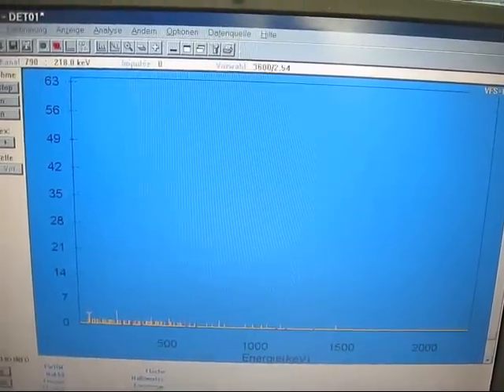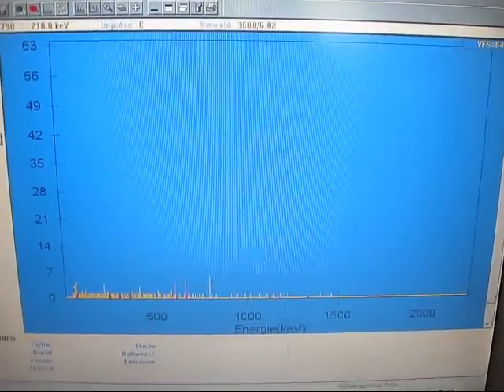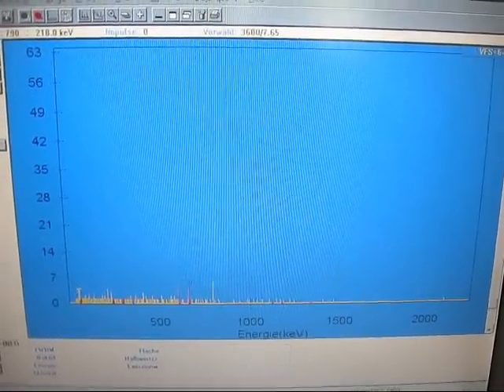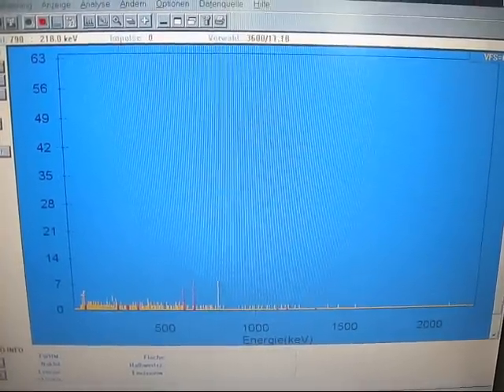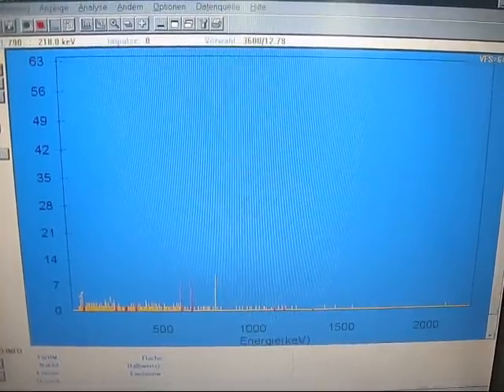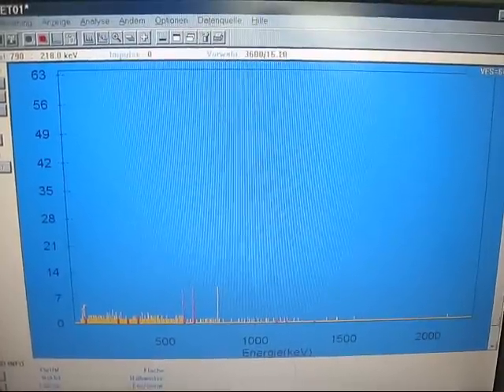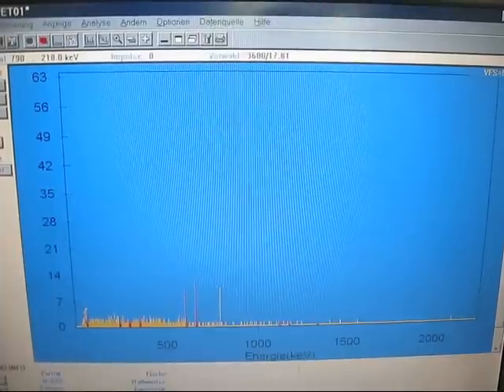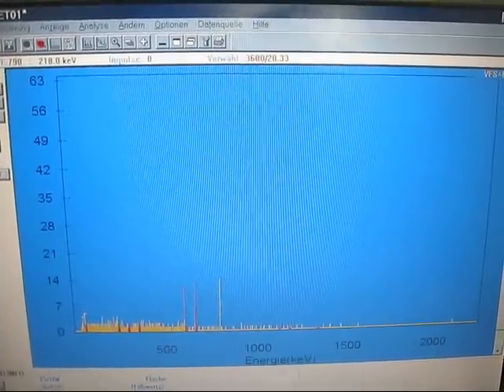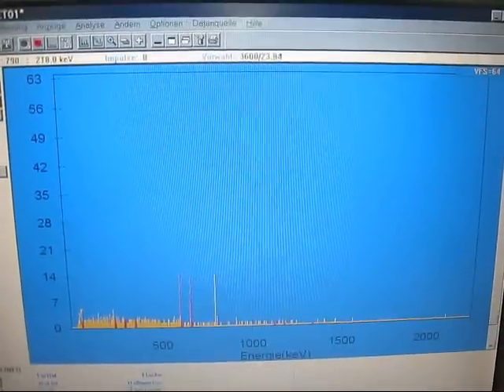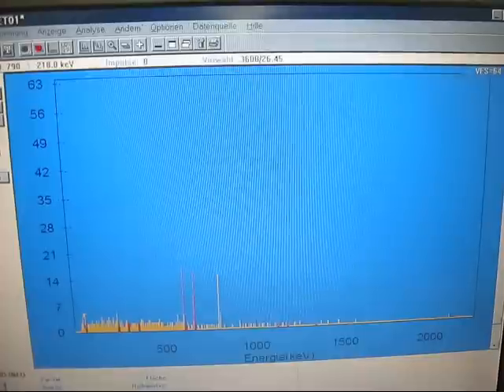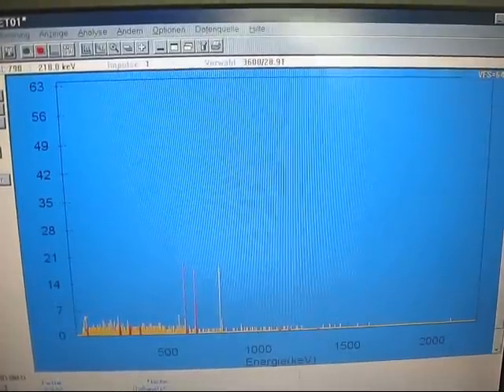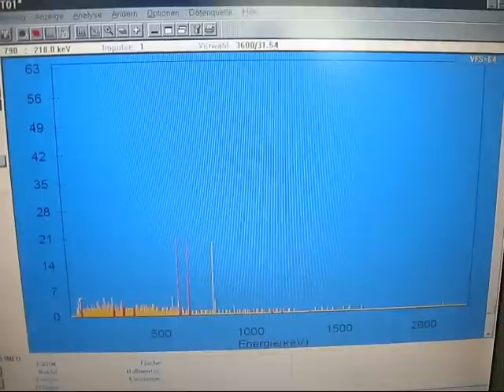What we're gonna do next is get an actual proper geometry calibration, so we can tell how much activity is within the samples, to about 5% plus or minus. And we're also gonna try and get at least a reading of the beta activity of the samples as well, to determine if there's any strontium-90 here and there. Not sure about alpha, but we'll see what we can do.